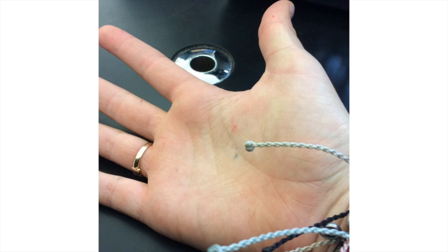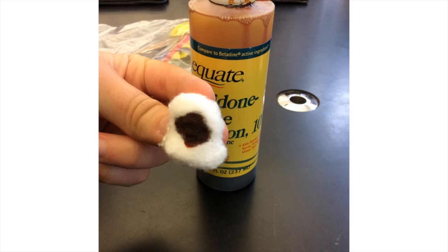So, the first step was to wash the palm of your hand so that it was nice and clean. So there is the palm of my hand. And then I took this betadine iodine solution, and I placed it upon a cotton ball. And then I rubbed all of the iodine solution all over the palm of my hand so that it was nice and covered, and there was a good even amount all over my hand. Because that is important for the accuracy of this lab, to make sure that it's nice and even.